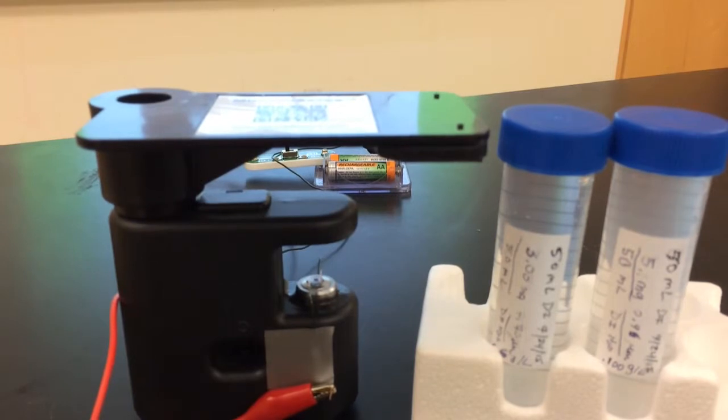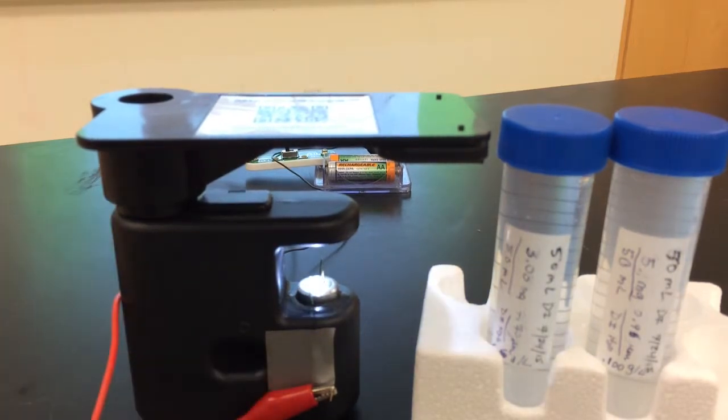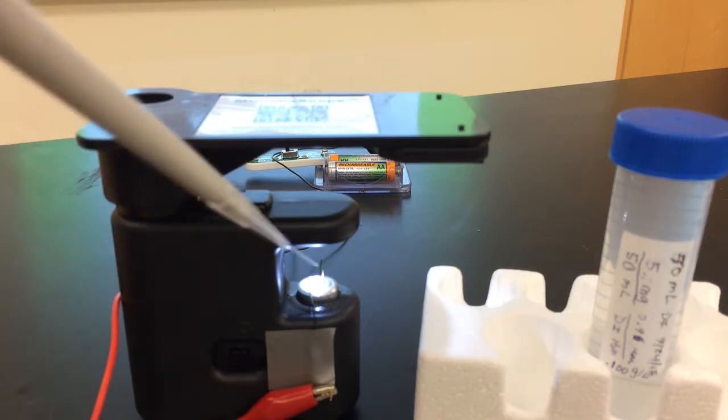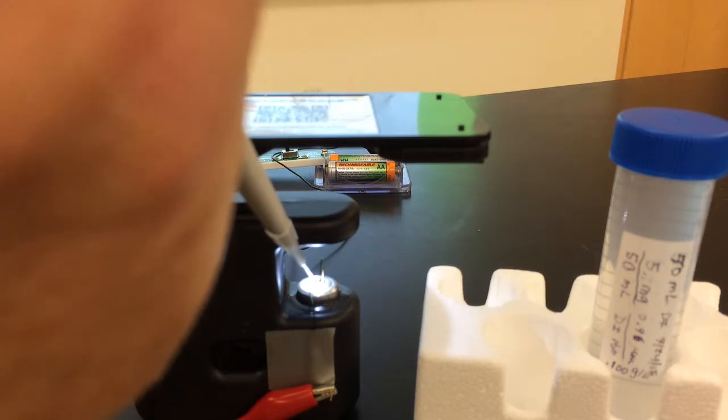So I'm trying to do this all in one take. We'll see how lucky I get. Here is our apparatus. You can see the microscope right there. We've got a light source right there. I'm going to go ahead and put in some 8-micron beads right now. 20 microliters, about 0.6 grams per liter.